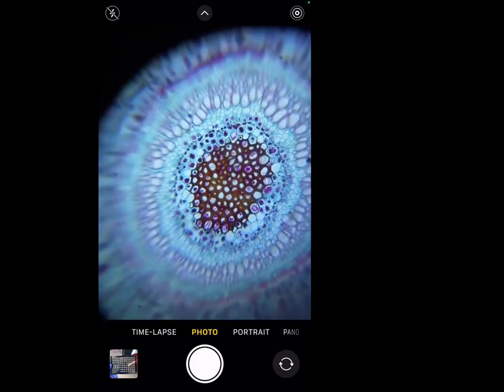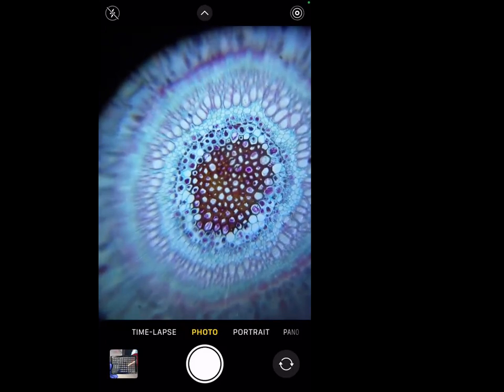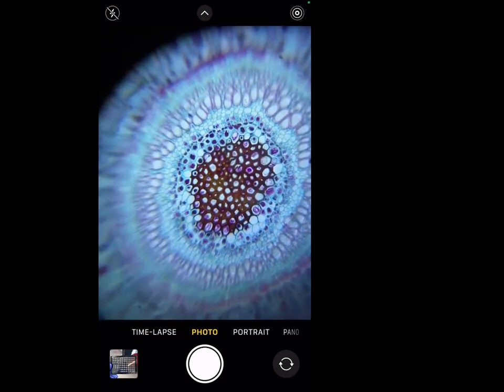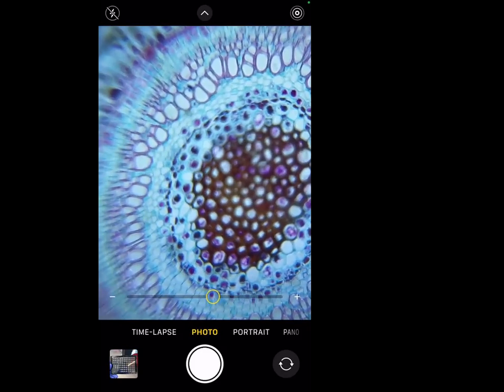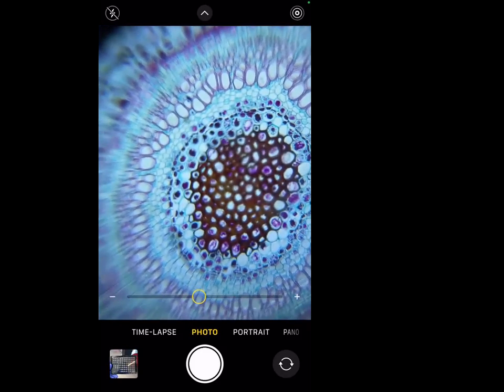Jim, is it Jim? No, Chip. Okay, Chip. But then you have to focus, assuming that the sample is right at the center of your lens. You have to try to see if focusing helps. Okay, let me work on that. Yeah. So there you go. We have a picture here. I will zoom in a little bit more, and I can take a picture, send it to you.